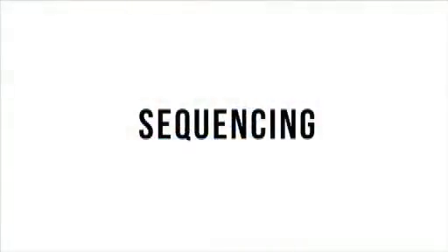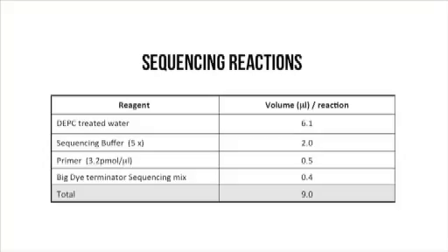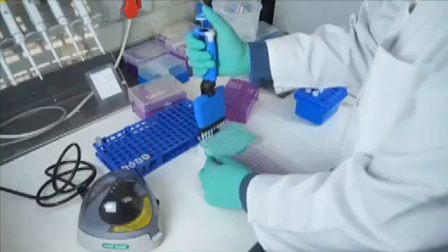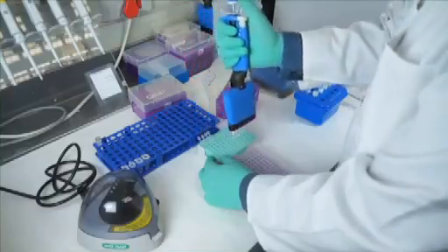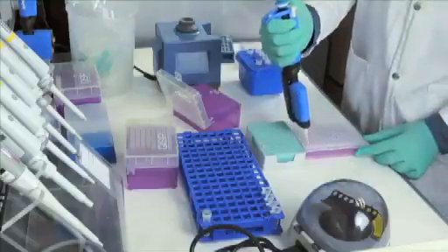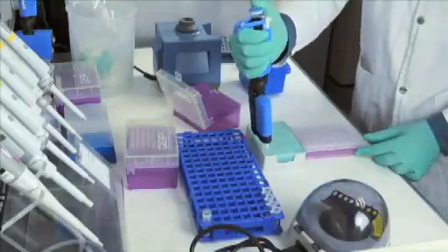The PCR products are sequenced using the Big Dye Terminator Kit, version 3.1 and 4 primers for each sample. For each of the primers, set up the sequencing reactions as indicated on the table. Gently mix the master mix by inverting the tubes. Gently aliquot 9 microliters of the master mix to a 96 well plate. One plate will run 24 samples.